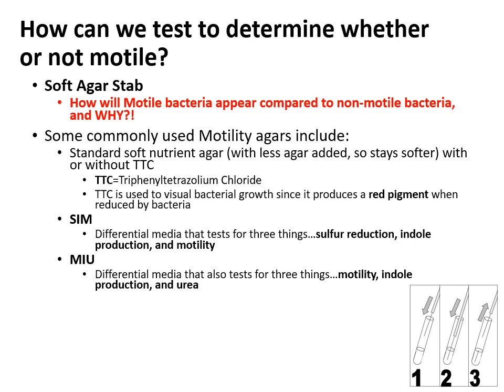If it's motile, what will it do? It will move around. It'll move away from that line. If it's not motile, then it will stay in place. And I'm going to show you a picture of what we mean in the next slide.